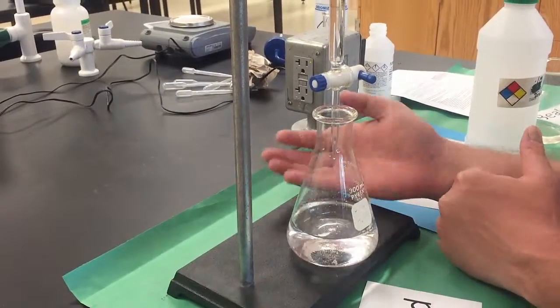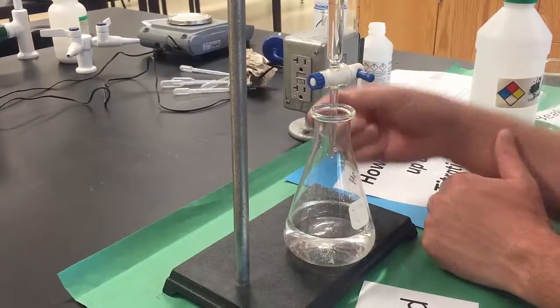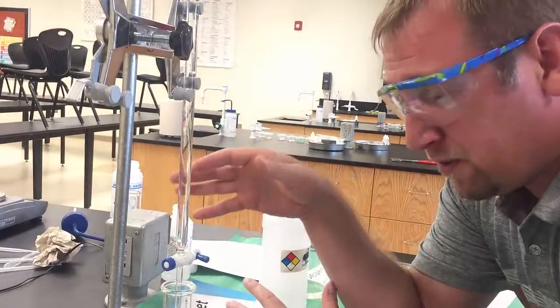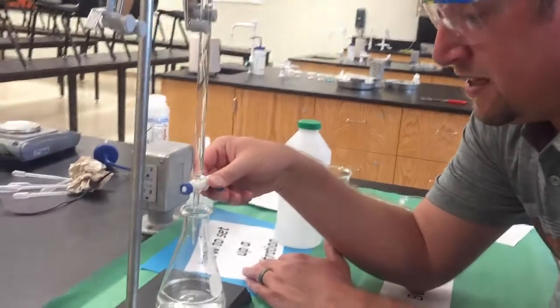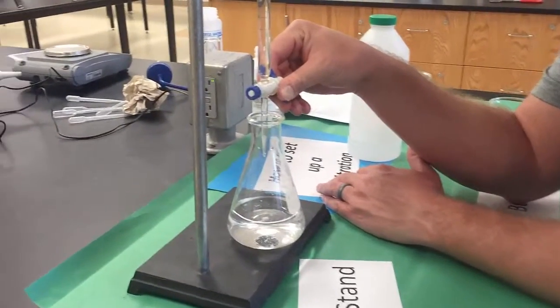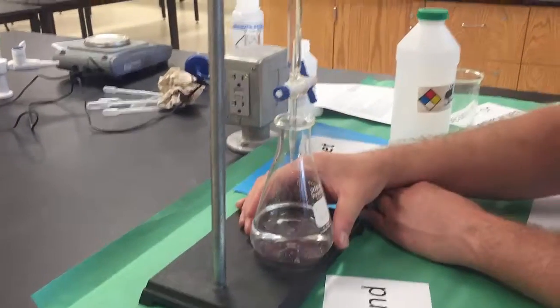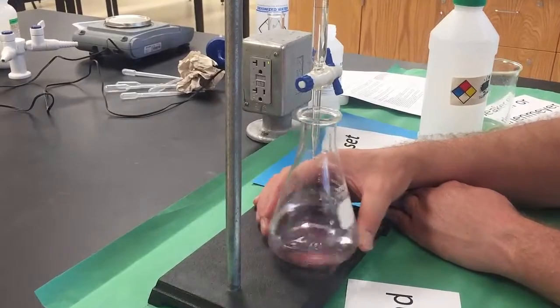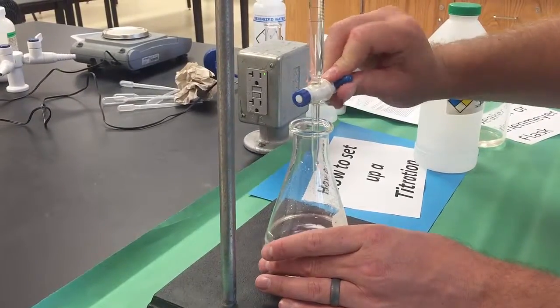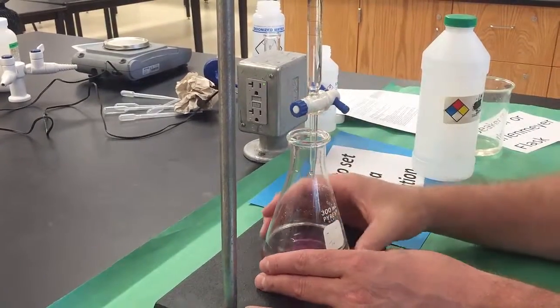So where I'm at now, I put in about 25 milliliters of sodium hydroxide into my next sample, which would be our first official trial. I know it's going to be somewhere between 25 and 30 milliliters. So at this point, there's lots of techniques. Your lab partner and you can work together. One can swirl, one can run this valve. I've seen some people that will get a nice steady drip like this and continue to swirl. I've seen, if you turn the valve back and forth, you get little squirts.